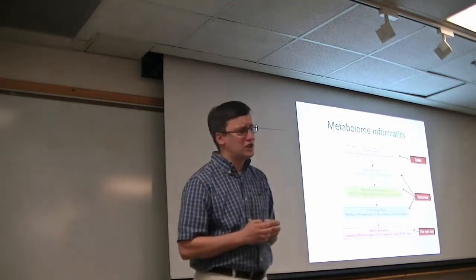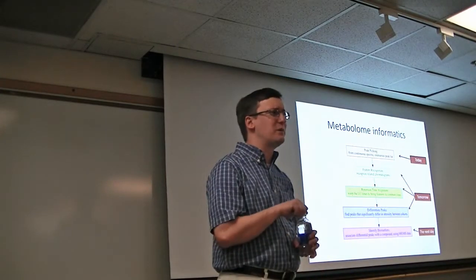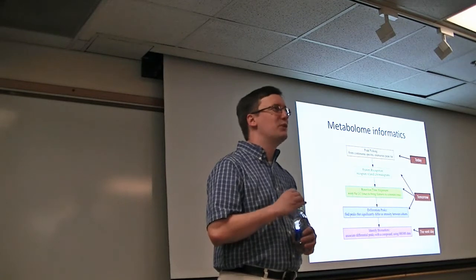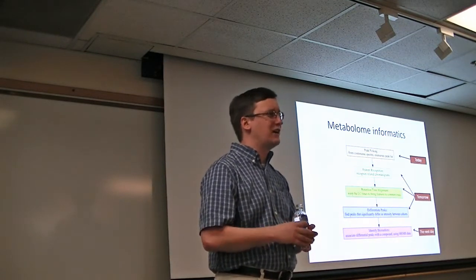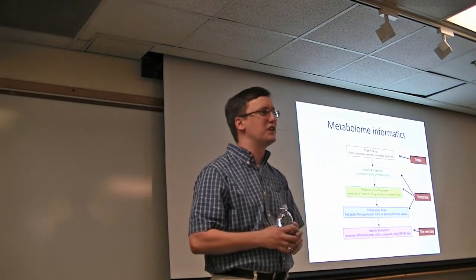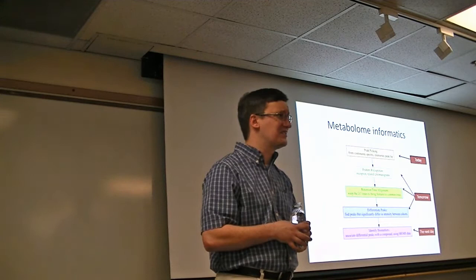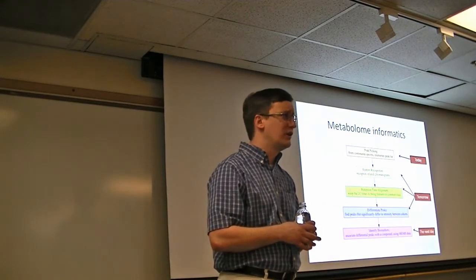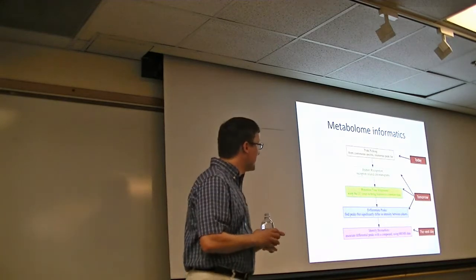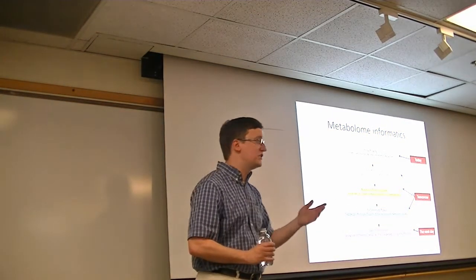And then differentiation. Differentiation is a huge challenge that shows up in all kinds of places. And it's more than simply digging through the table and saying all of the A's are higher than all of the B's. There are a lot of pieces to it that we really need to understand pretty well. And for that, we're going to talk a little bit about statistics. That comes tomorrow afternoon in the later part of the session. So we'll talk about the stats and figure out how we can determine reliably which features are differentiating two cohorts of samples.